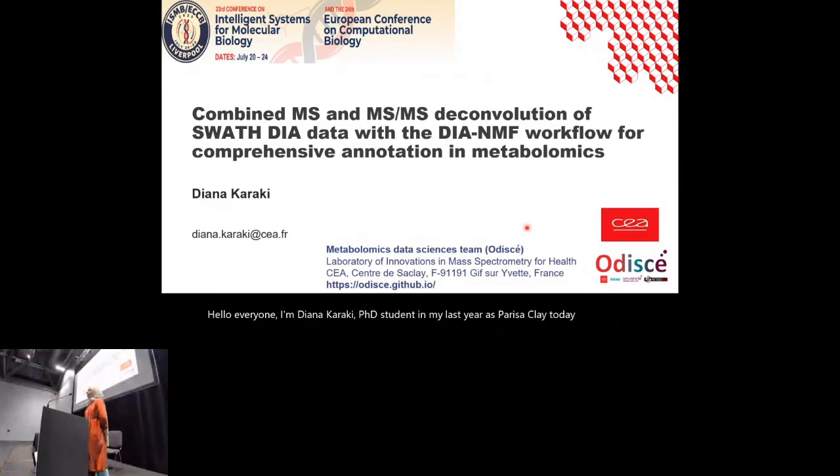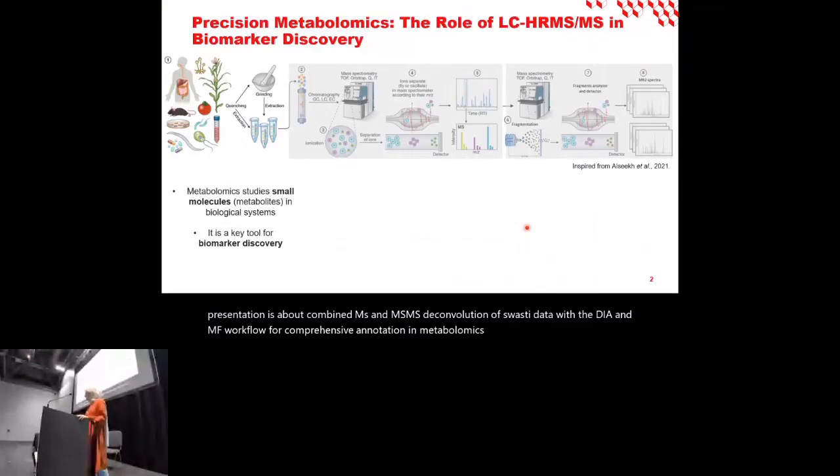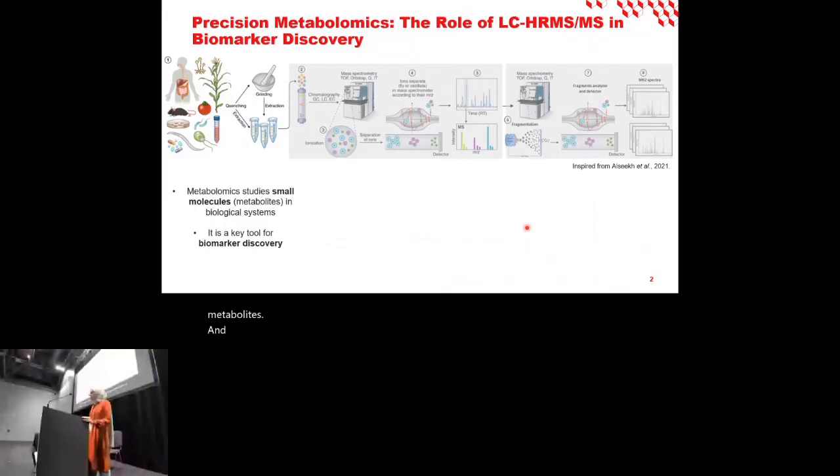Today's presentation is about combined MS and MS/MS deconvolution of SWATH DIA data with the DIA-NMF workflow for comprehensive annotation in metabolomics. What is metabolomics? It's the study of endogenous and exogenous small molecules in biological systems, known as metabolites, and nowadays is a key tool for biomarker discovery.